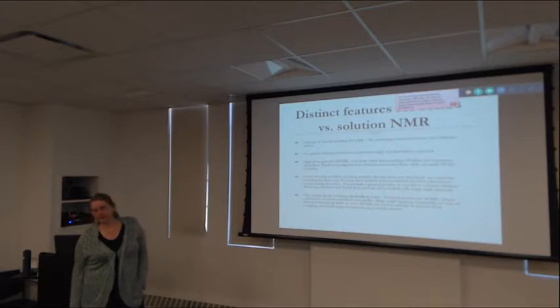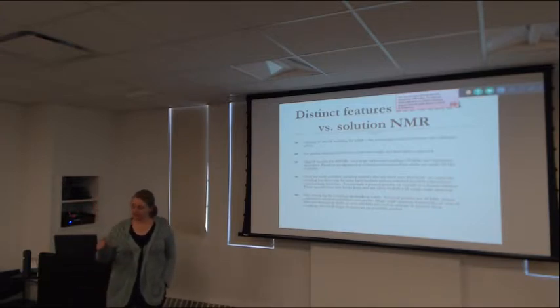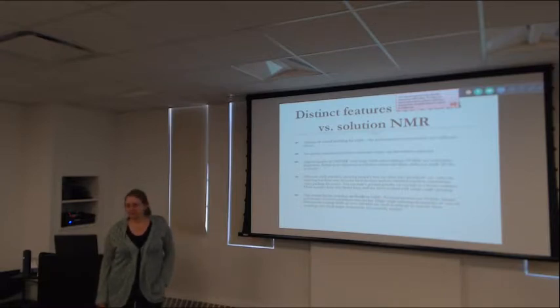A definite format of an experiment, besides magic angle spinning, is to take the sample and orient it. This is an experiment that's used to study membrane proteins, for example, in the labs of Opella, Cross, and other people, Cross in Florida. You get from that experiment very big effects plotting the chemical shift as a function of angle.